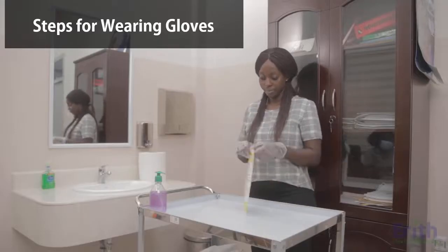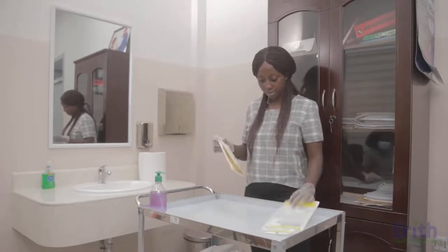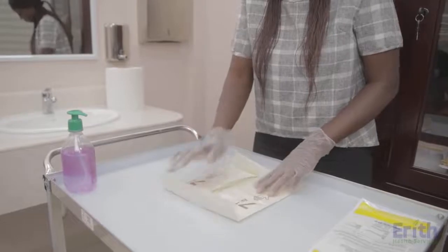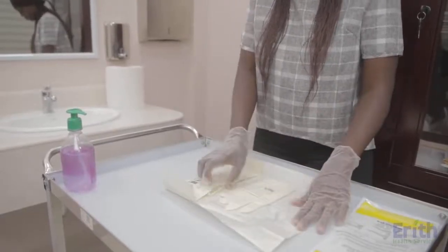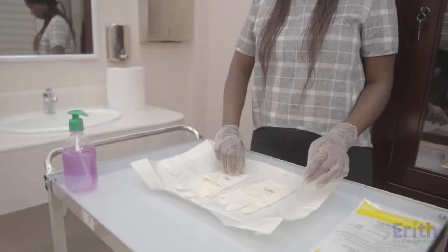Steps for wearing gloves. Open the package containing the sterile gloves. Carefully open the inner wrapper, maintaining aseptic technique, being careful not to contaminate the gloves by touching them.